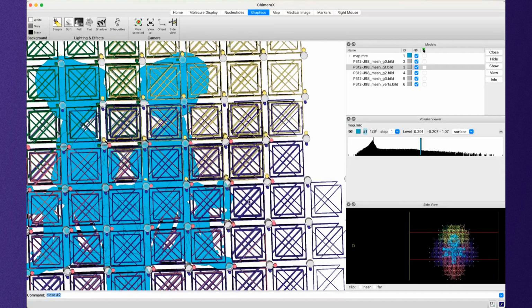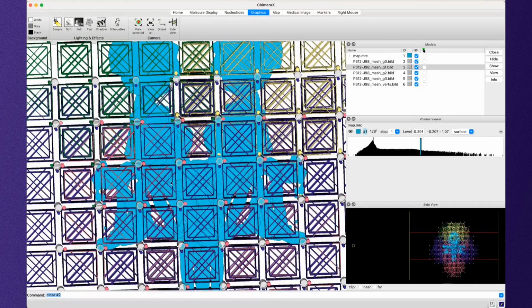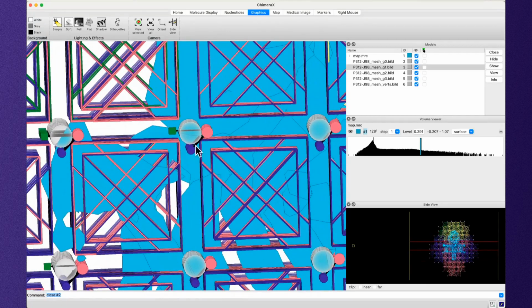So the micelle here would be fused and rigid to this, which would hold this interface rigid, which would then hold these vertices rigid. Anything shared by yellow, pink, and blue or purple would be held rigid. But over here, where you just have, for instance, pink, green, and purple, these would not be rigid, even if the micelle is rigid, because this fusion between pink and purple would not be happening.